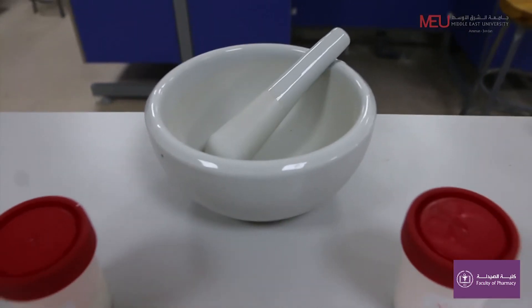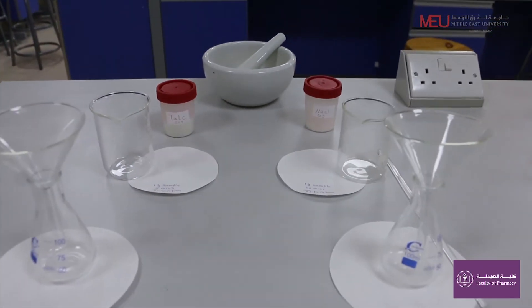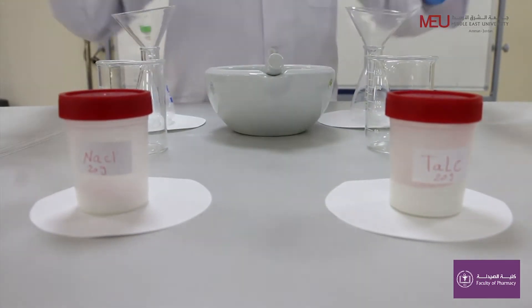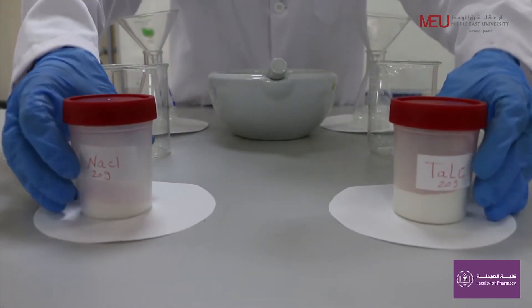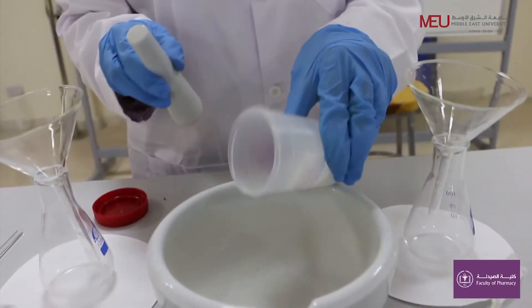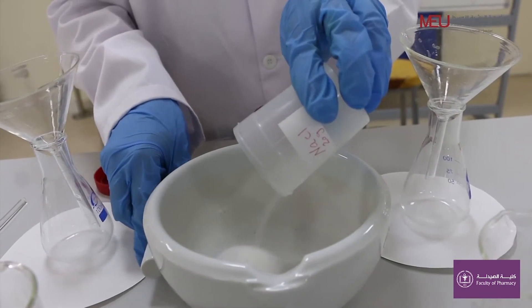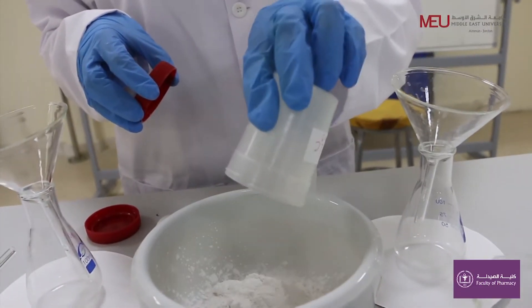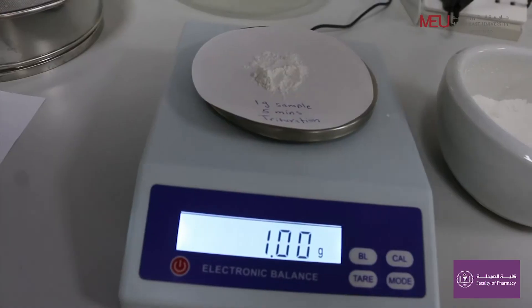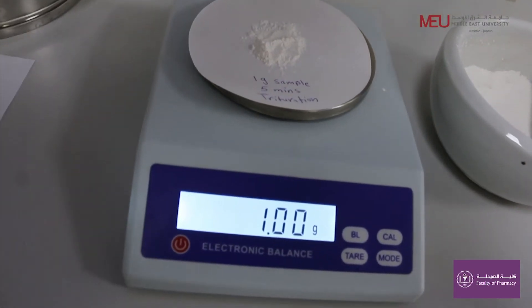We will now start with dry trituration. Weigh 20 grams of insoluble powder talc and 20 grams of soluble powder sodium chloride. Mix first for five minutes.